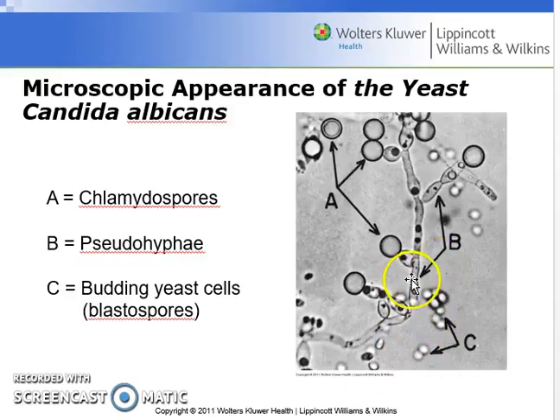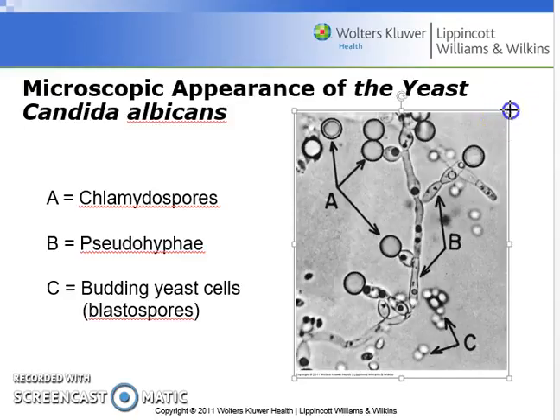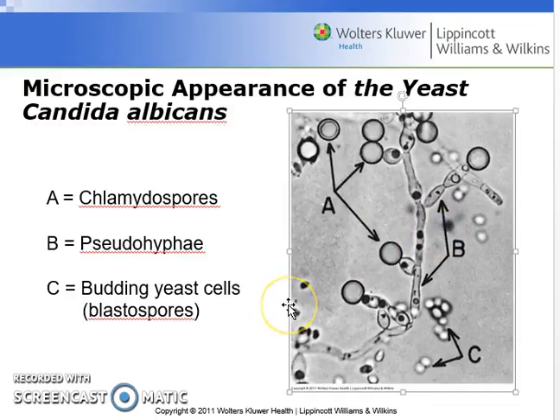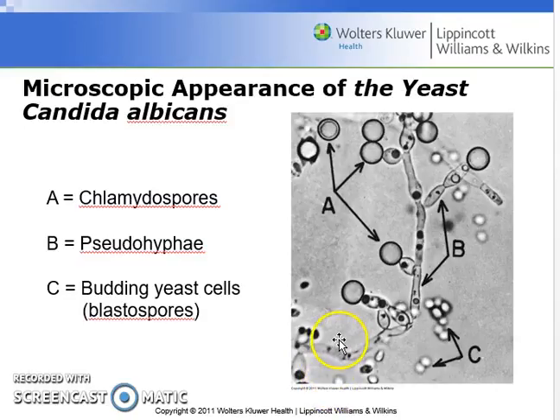So when you look at this under a microscope, unless you have good familiarity with what it is you're looking at, you kind of would be looking at it like, oh, well, this just looks like a big bunch of circles. But then over time, after looking at so many slides of these particular organisms, you would come to understand exactly and clearly what these structures look like.